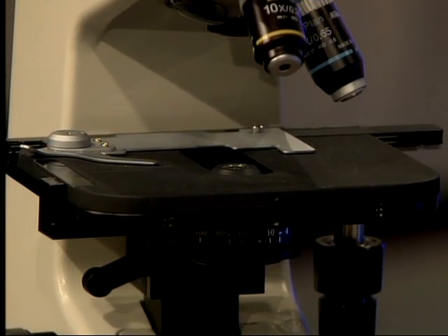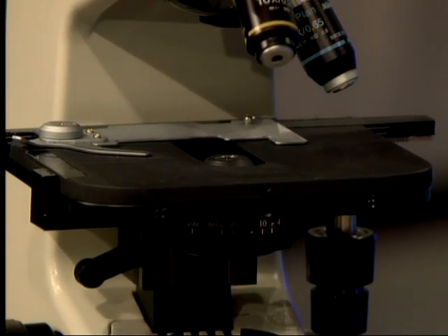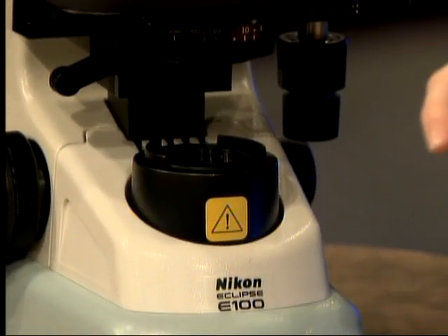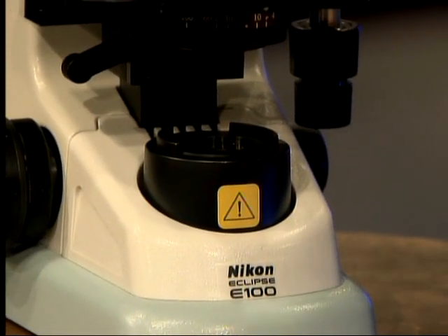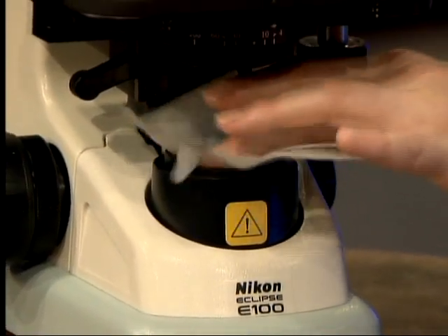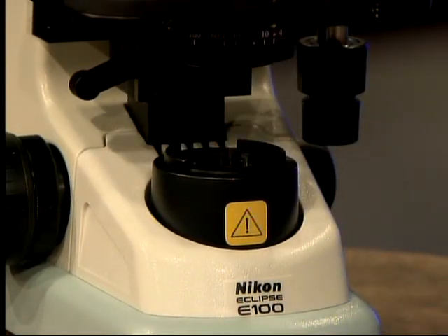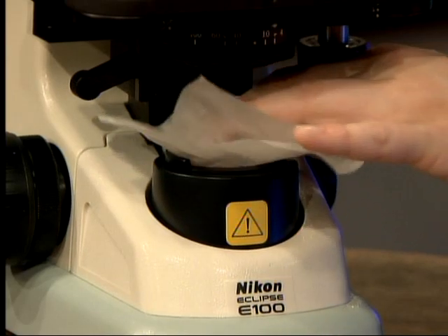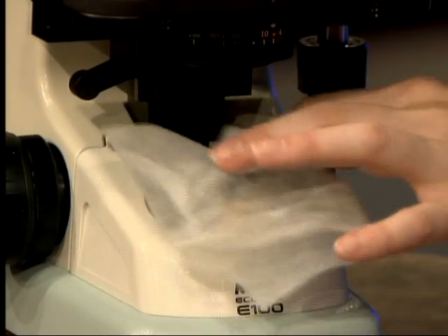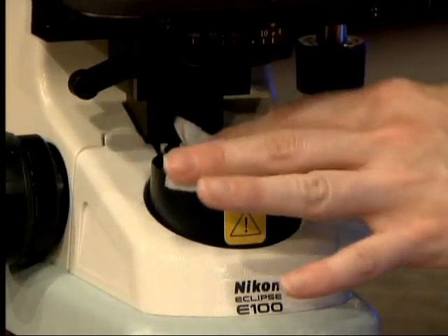The last lens to clean is the field lens at the bottom. Take your moist lens paper and add one more drop of lens cleaner. Work in a circular fashion to clean the lens at the bottom, then take dry lens paper and buff it dry, making sure all water spots are removed.